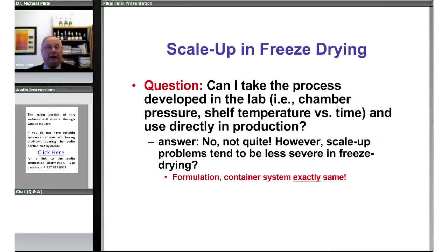Question on scale-up is, can I take a process developed in the laboratory, and by that I mean the time sequence of chamber pressure, shelf temperature, and can I use that directly in production? And a good friend of mine, an old friend, Felix Franks, once said that you have to remember that you're not freeze-drying the shelf, you're freeze-drying the product.